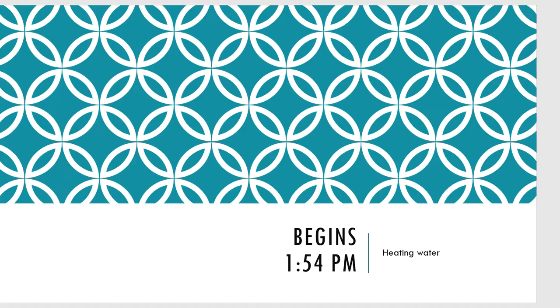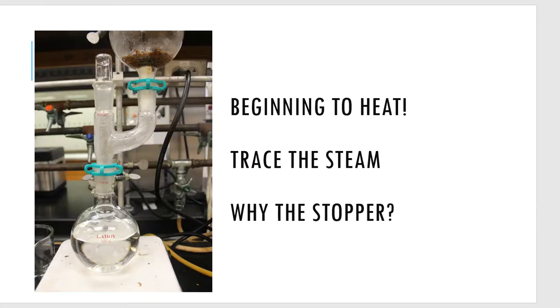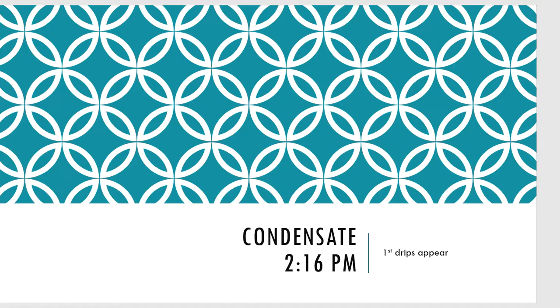At 1:54 I add the water, turn the hot plate on, and go with it. It is beginning to heat, and I can see my water. Look at all the condensation happening in the Claisen adapter — that's a very good sign that water is turning into vapor. This vapor is escaping into the Claisen, where it's a little cold in the beginning, so it's condensing that vapor back to water and dripping back down into the Florence flask below.